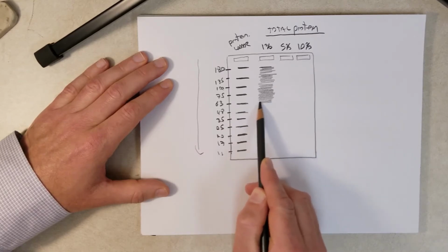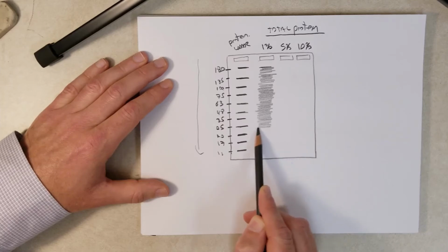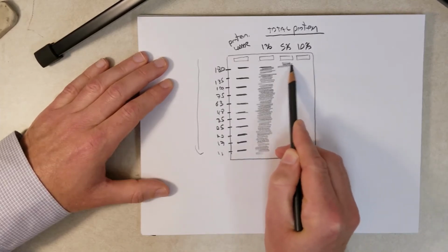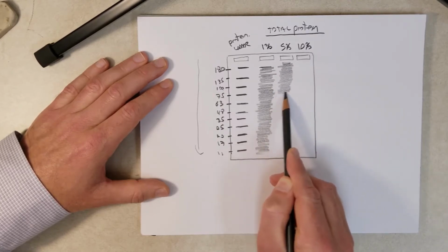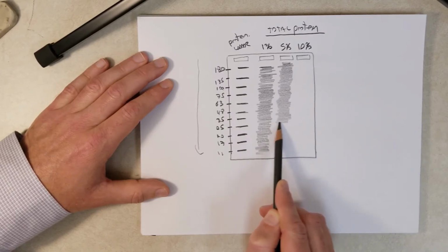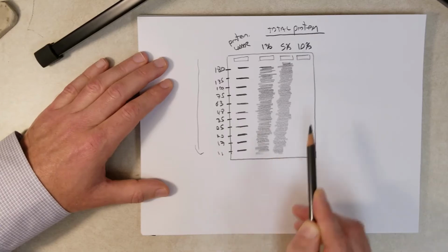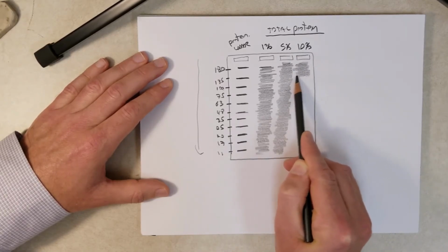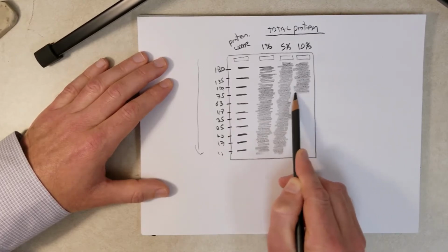All the proteins of pretty much every imaginable molecular weight are going to be in here. And as long as we load equal amounts of the total protein in each well, we really shouldn't see any differences here. Because there are probably tens of thousands of different proteins in here, assuming about 6,000 genes in Saccharomyces cerevisiae, and some alternate splicing going on.